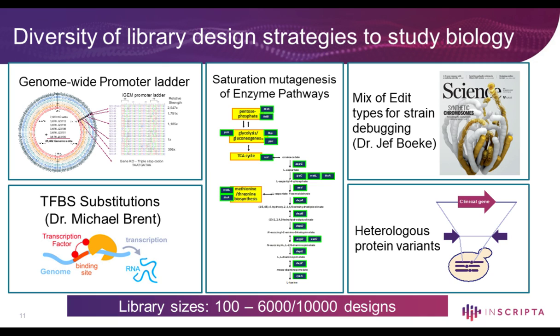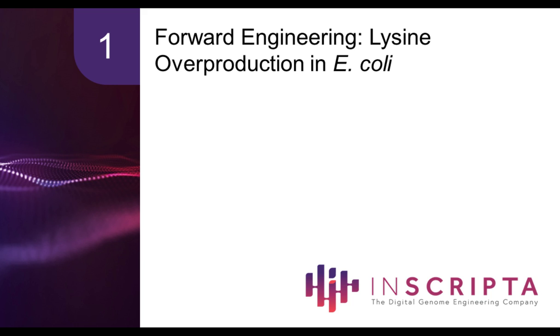The first example I will talk about is the use of this platform in forward engineering to rapidly identify phenotypes of interest. And a second example would be in genome discovery, where you rapidly identify causal genes that control growth in engineered yeast strains.